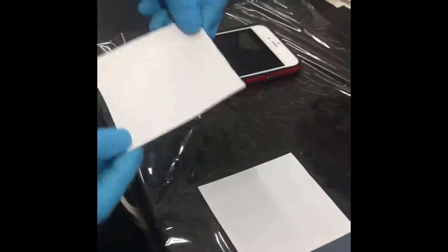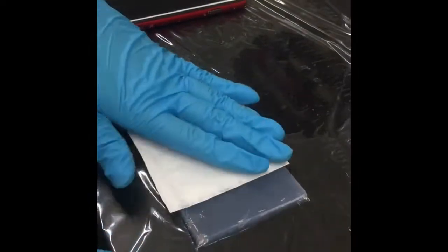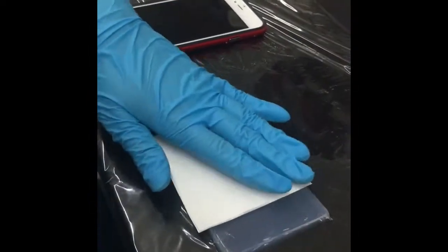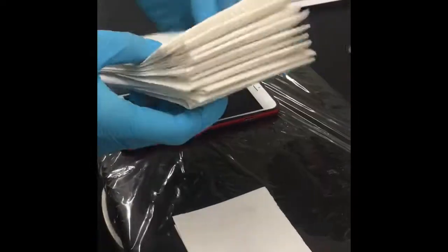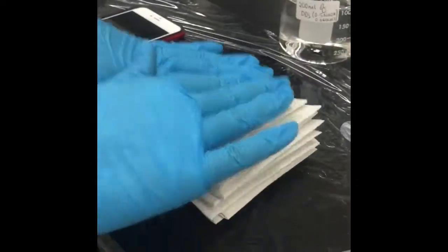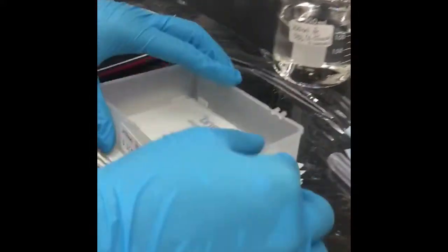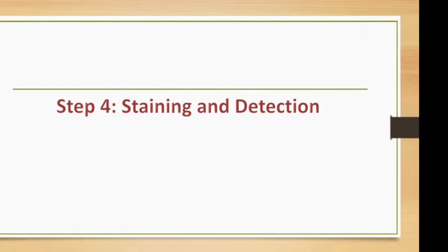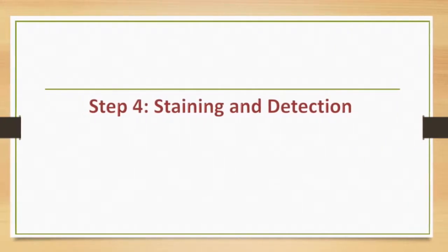Then we put a piece of filter paper on top of the membrane and we place a stack of paper towels, along with a tray to put the beaker on top of it to apply pressure. Then we move on to step 4, which is the staining and detection.